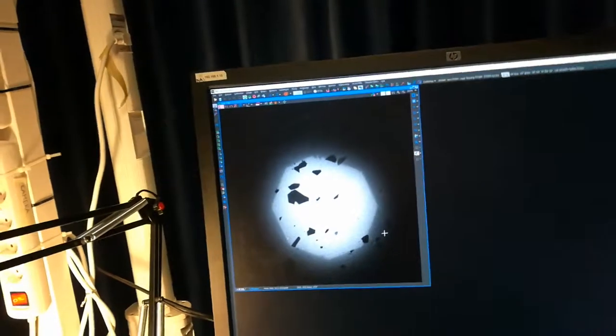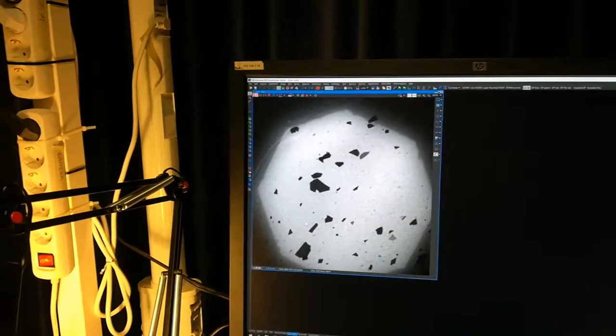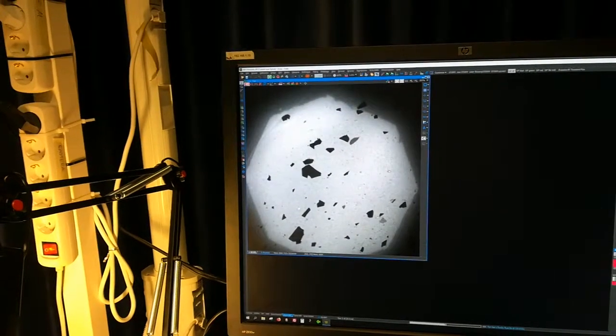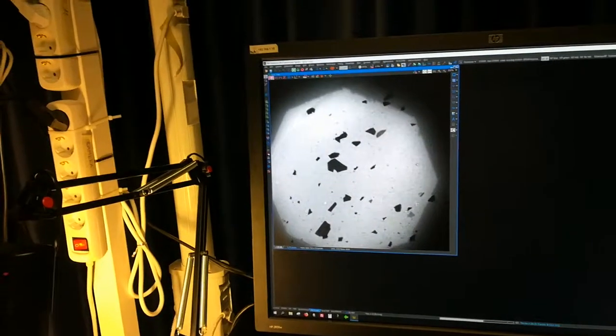Once I think it's more or less at the center, I can reopen the field stop. And if we look at the screen, when I reopen the field stop, I can see that the shadow is going to get closer to the edge of my field of view. That's very convenient so that I can actually see whether it's almost centered or not. So now I can again move the screws to put it exactly at the center. It's not super easy because I'm used to doing it in the eyepiece.